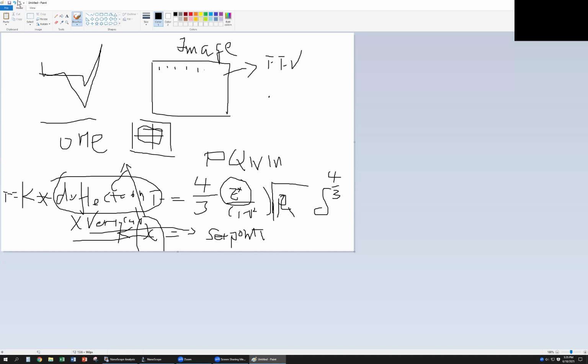You must have this kind of samples if you want to quantify your data. If you just want to compare, you don't need to know the exact number for the modulus. You can use some data the factory gives you. For example, we have the K, right? In each probe box, they have the K value.